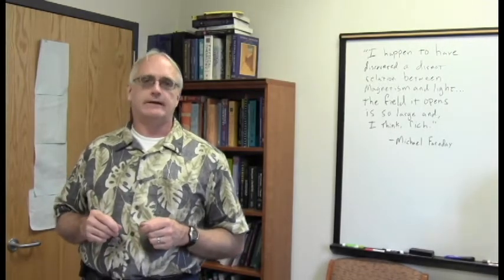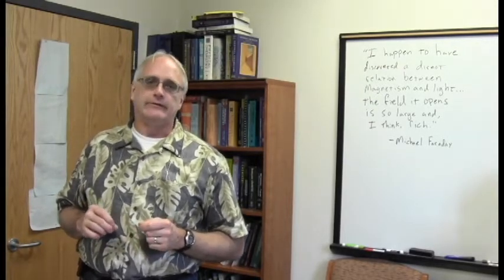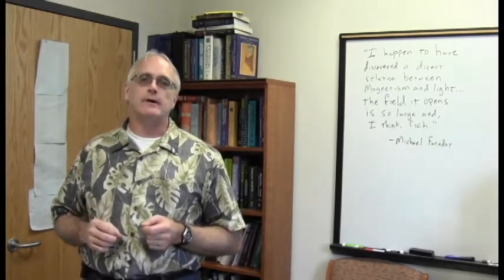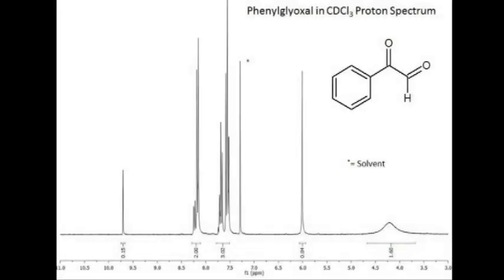We found the material did not dissolve very well in deuterated chloroform. We got a little bit in solution though, and so we went ahead and ran the spectra, and this is what we saw. Now I point out the solvent peak in here. With a solvent peak of deuterated chloroform, remember it's right at 7.26 ppm, being this large, it is clear that the sample is not terribly concentrated. Your residual solvent peak should be a lot smaller than this. This is just a nice sign that the material did not dissolve well at all, but we did get a reasonable spectrum out of it.